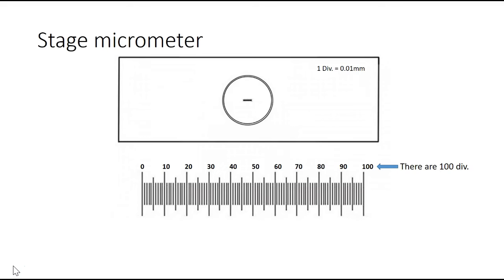So there are a total of 100 divisions, and I can count these large division markers by multiples of 10. Likewise, I can also count the number of divisions by fives if I include the midsize division markers. The midsize markers in combination with the largest ones help me count by multiples of fives — from 0, 5, 10, 15, all the way to 100. What those numbers represent is that there are a total of 100 divisions in this tiny ruler.